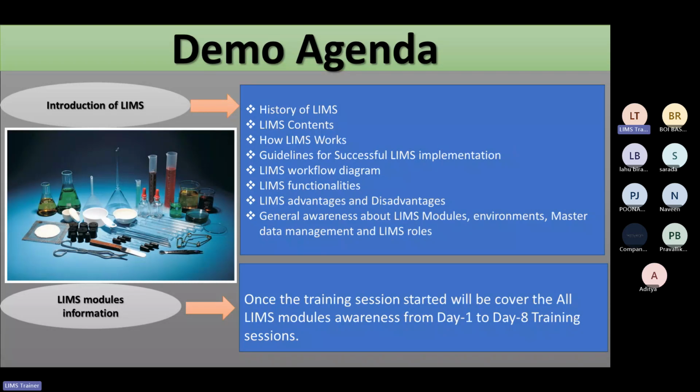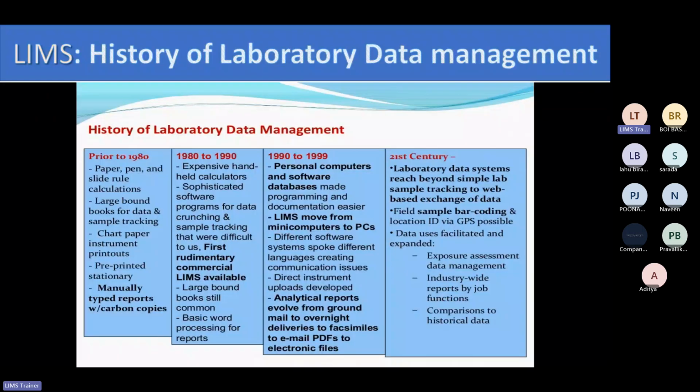See the history. If you are aware about a laboratory, anybody who has not worked in a laboratory, or has not visited any laboratory, and is not understanding how a laboratory works? Anybody here? Okay, so basically you all understand what a laboratory is.